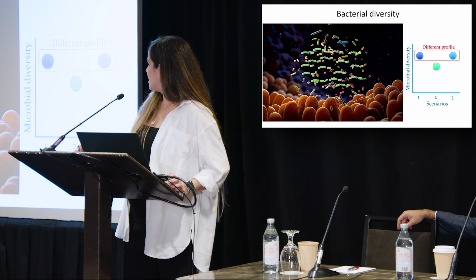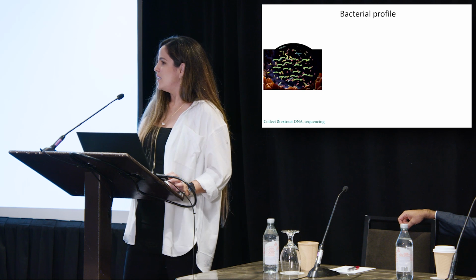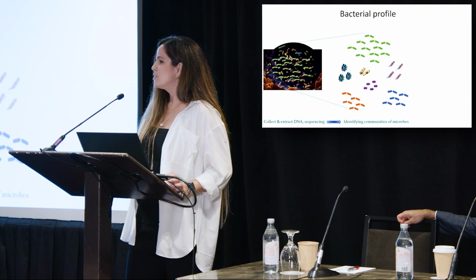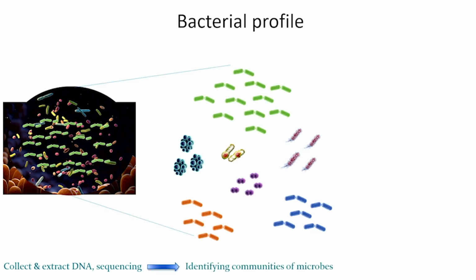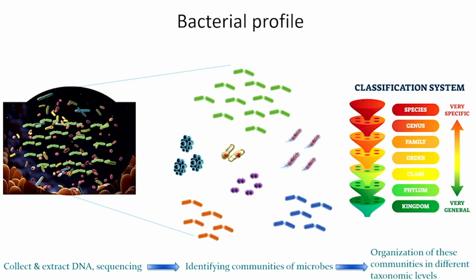And the way that we do that is applying all those pipelines where we organize this data. We organize these microbes by their types, and by their abundance as well. It's important to know how many we have of each one in a specific environment. So we separate them like this, but by bioinformatics, right? And then after separating them, we apply different platforms where we can actually classify these microbes.